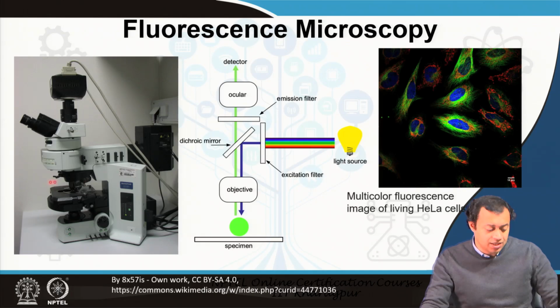And by doing all those dark field, bright field, bringing this closer, bringing this further, you can get a super resolution microscopy, laser scanning super resolution microscopy, where only one single molecule is being detected. It is possible, not by me, I cannot do that. I have tried and failed, and this is one of my regrets in life, but some people do it.